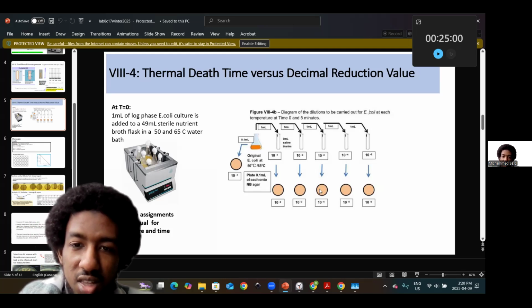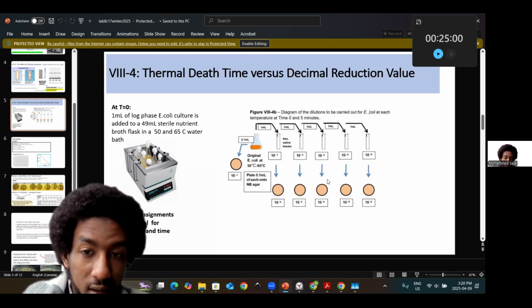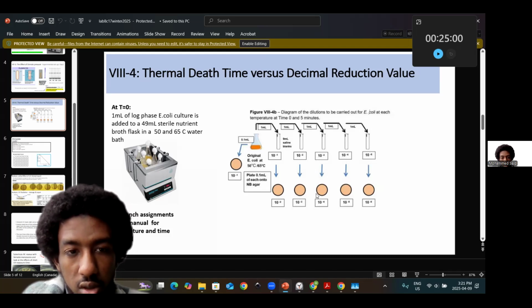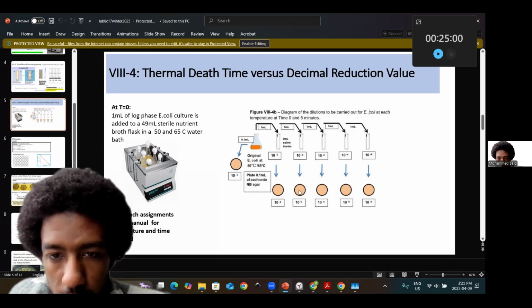The idea that I'm saying this is so that you can appreciate that the 10 times reduction in dilution should impact, hypothetically, the population that you're able to count of viable colonies. So the viable cell count thereby should, you can predict, go down by 10, or tenfold.